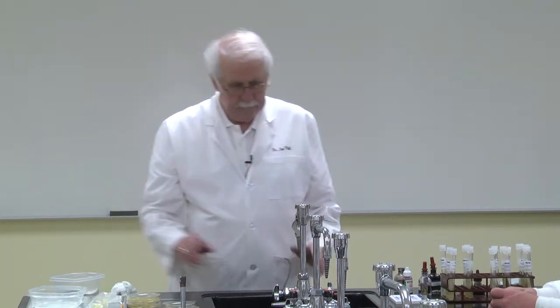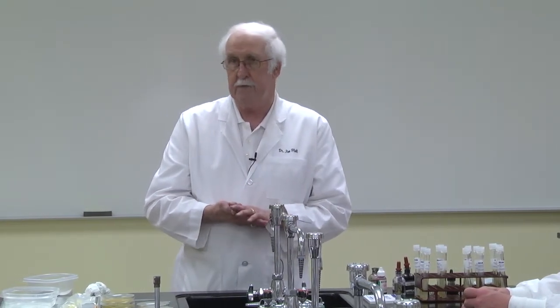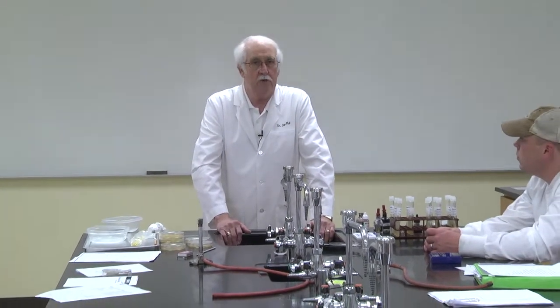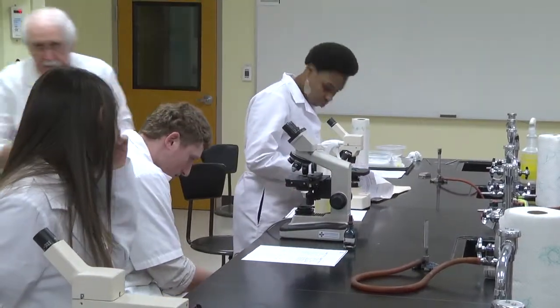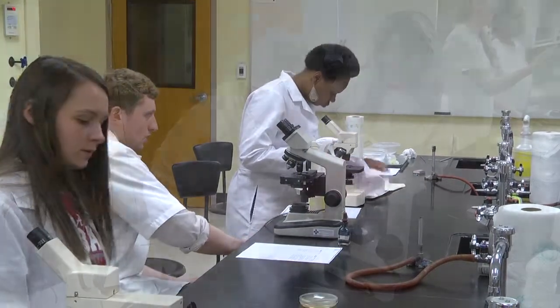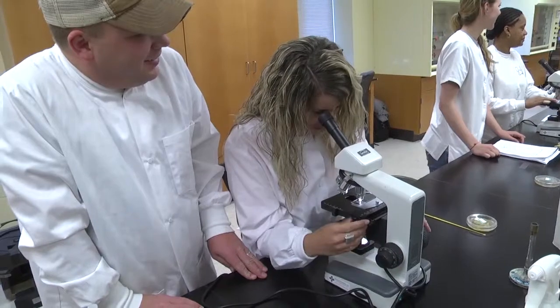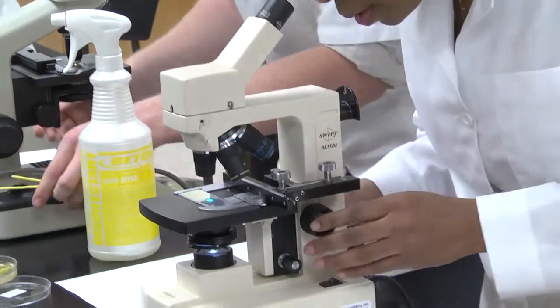Let me point out again that this is a negative stain in which we're staining the background instead of the cells. We follow this up with other staining procedures. The most important stain we do is the Gram stain, and that's also a differential staining technique. Sometimes we refer to the negative stain as a capsule stain. When the slime layer is sufficiently thick, it's referred to as a capsule. But in order to actually see the capsules, to see the halo, we use the nigrosin or we can use Congo red dye, something that will not penetrate the cell.